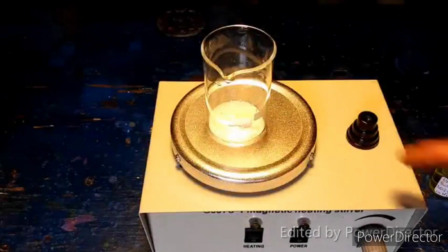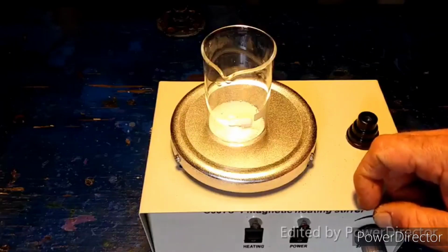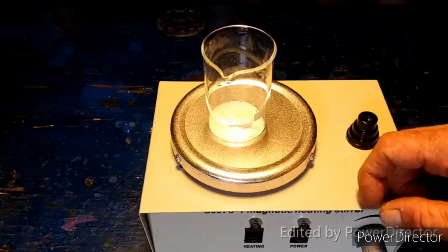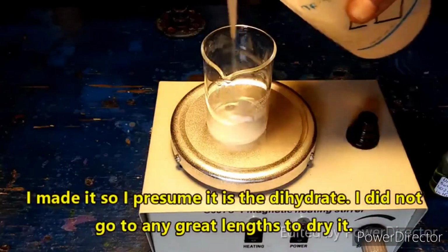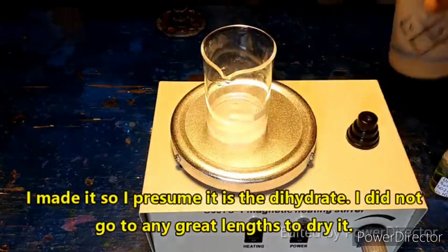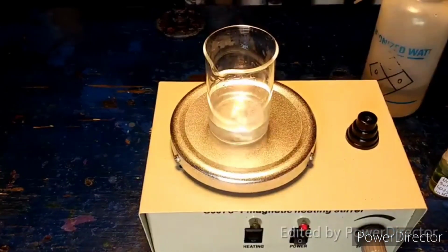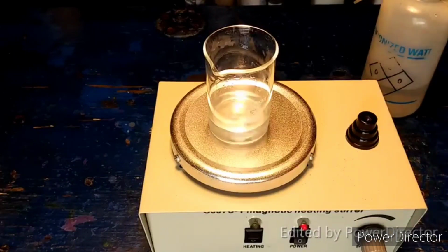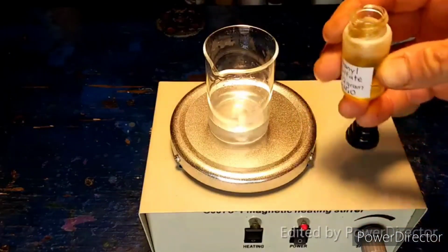So what I've got here is 1.36 grams of barium chloride, the dihydrate, I assume. And what I'm going to do is just add a little water to this. I want to try to keep the volume as minimal as possible. Alright, now that our barium chloride has dissolved, what I'm going to do is add this solution of uranyl sulfate that I made before.